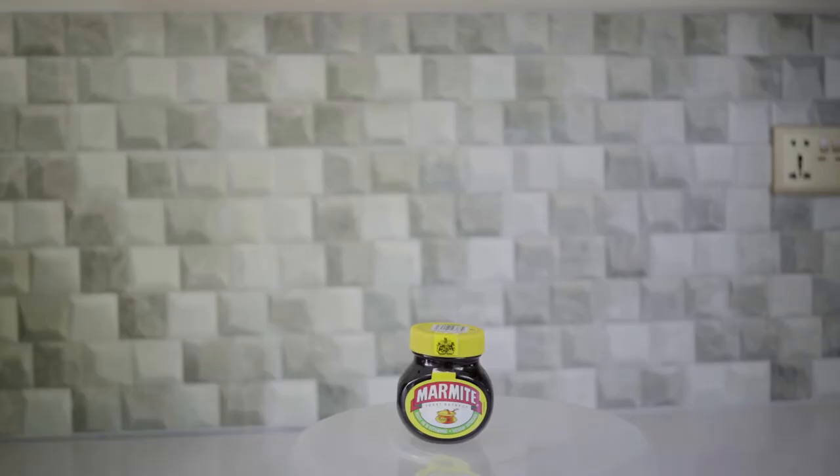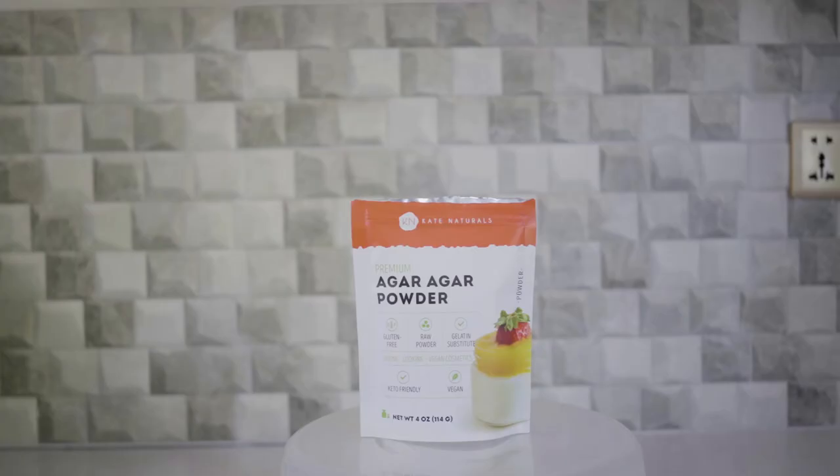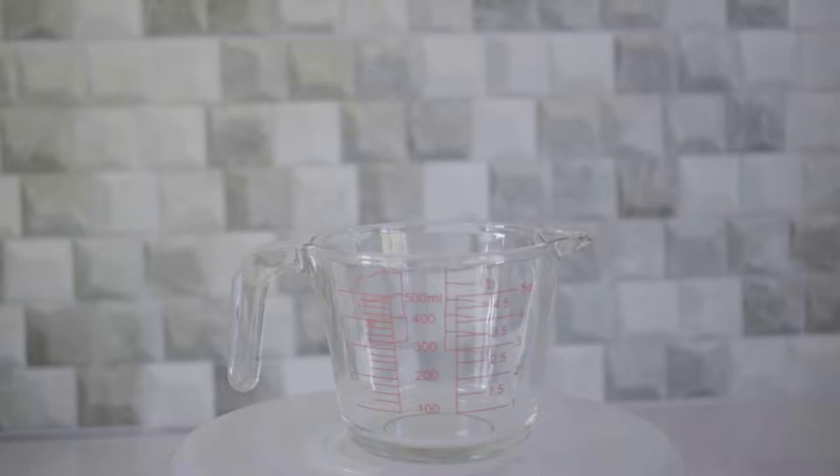This year's Science Fair project tries to answer that question. We started by creating an environment for our bacteria to live in. We used marmite, yeast extract, agar, hot filtered water, a measuring cup, a clean spoon and measuring spoon, and a clean surface.